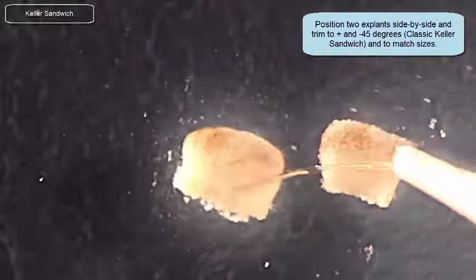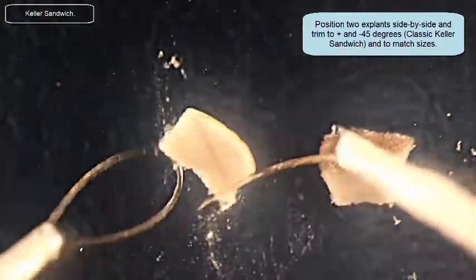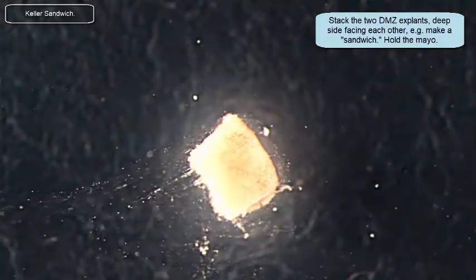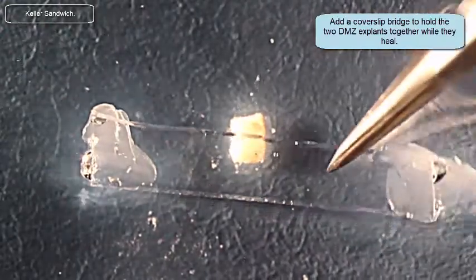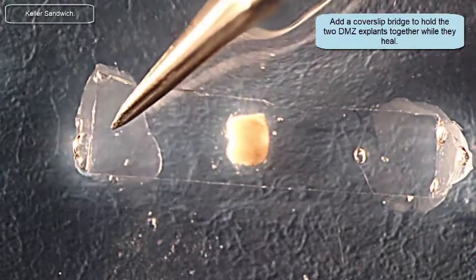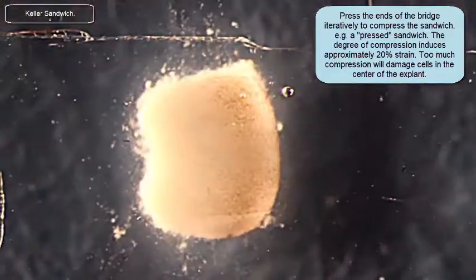It's really important for the sandwich to have two dorsal marginal zone explants that are about the same size. The one I cut a few seconds ago was a little too big, so I'm going to cut that down to size. It's good to have them both side by side so you can match them up. I'm going to place them one on top of the other and line them up. Now I'm getting a cover slip fragment with a dab of silicone grease on either end, putting it into the dish, positioning it over the explant, and then gently compressing the sandwich — the two explants together. You can think of it as a cold-pressed sandwich. I find about a 20% strain in that tissue really gets them to hold together and heal quickly.